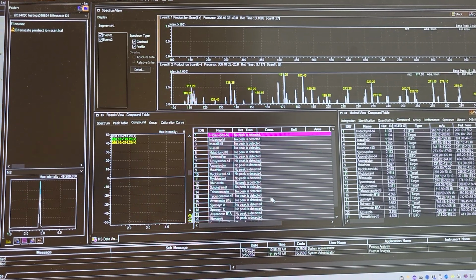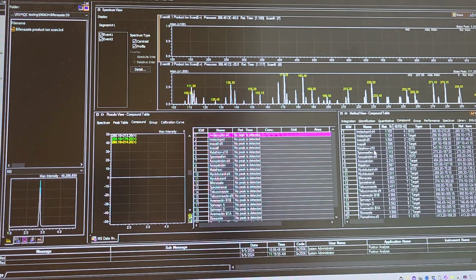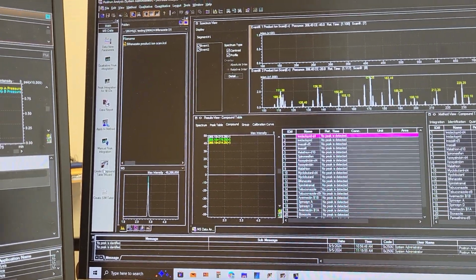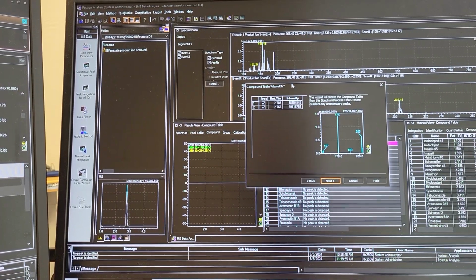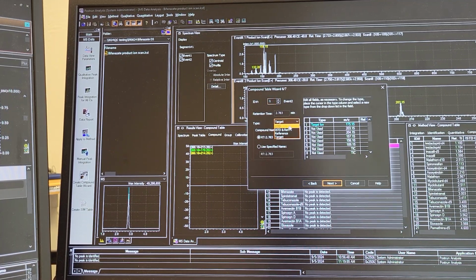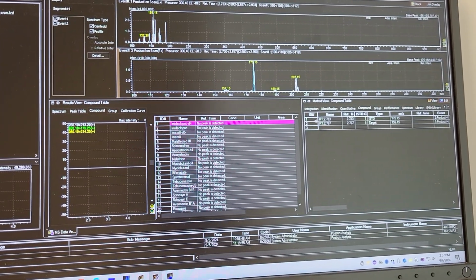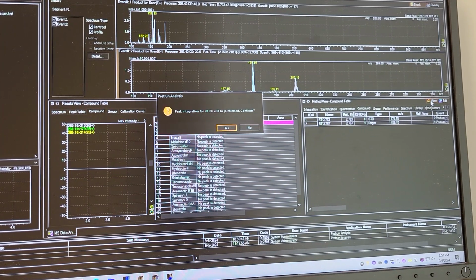I just finished the product ion scan. When I open up that data file in post-run analysis, my compound table is still my normal compound table for standard client analysis. So I'm going to go to create compound table wizard, integration of TIC, next, 2 processed peaks, next, next, next, next. Okay, now my compound table should be updated with just the 2 peaks corresponding to the product ion scans that I told the instrument to look for.